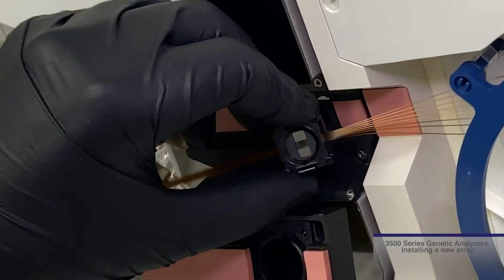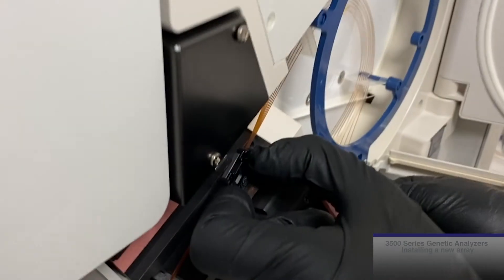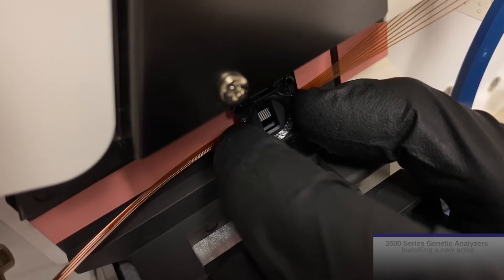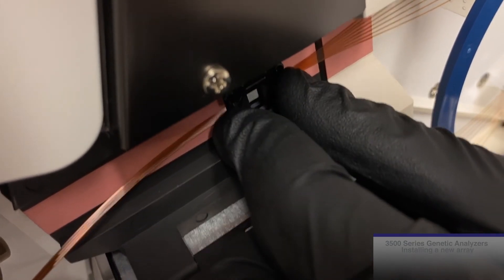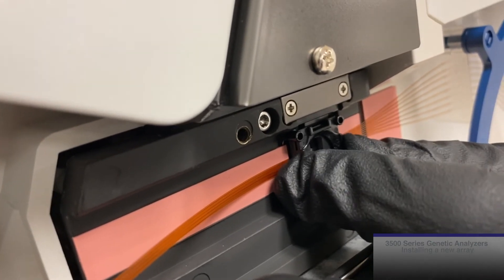The detection cell cannot be pushed straight into the detection cell heater block — it requires some slight manipulation. First, grab the sides of the detection cell, and with a slight downward angle, put the top two prongs in the top of the heater block, and then swoop the bottom two prongs into place. When correctly placing the detection cell, you will feel a slight spring resistance.